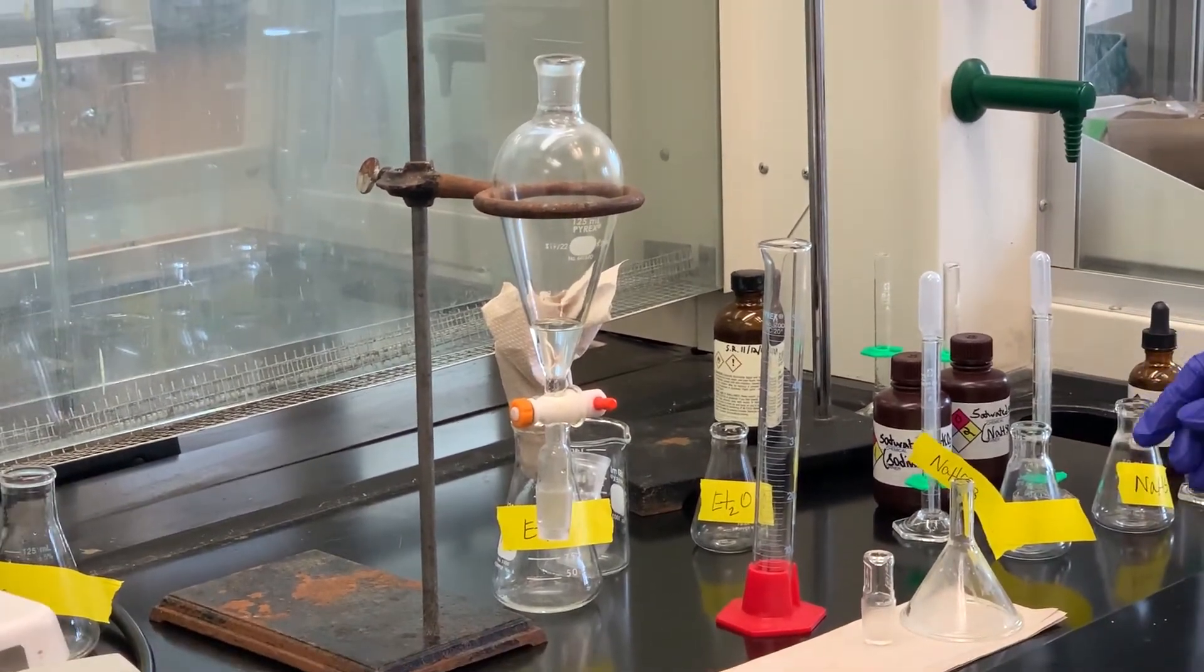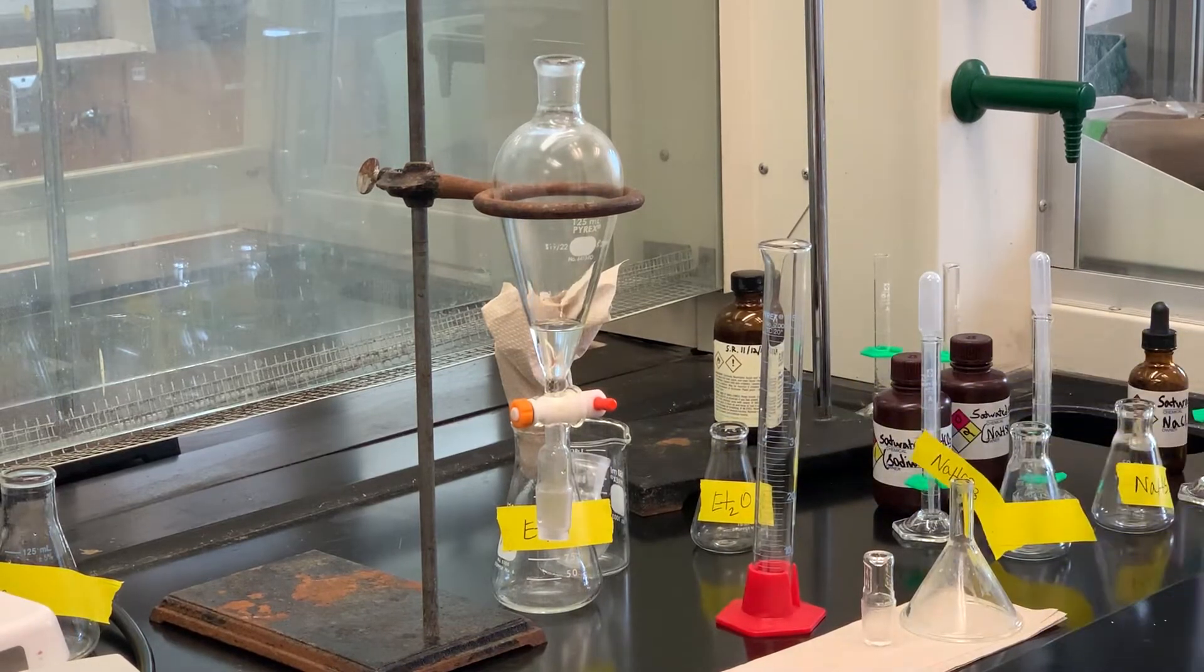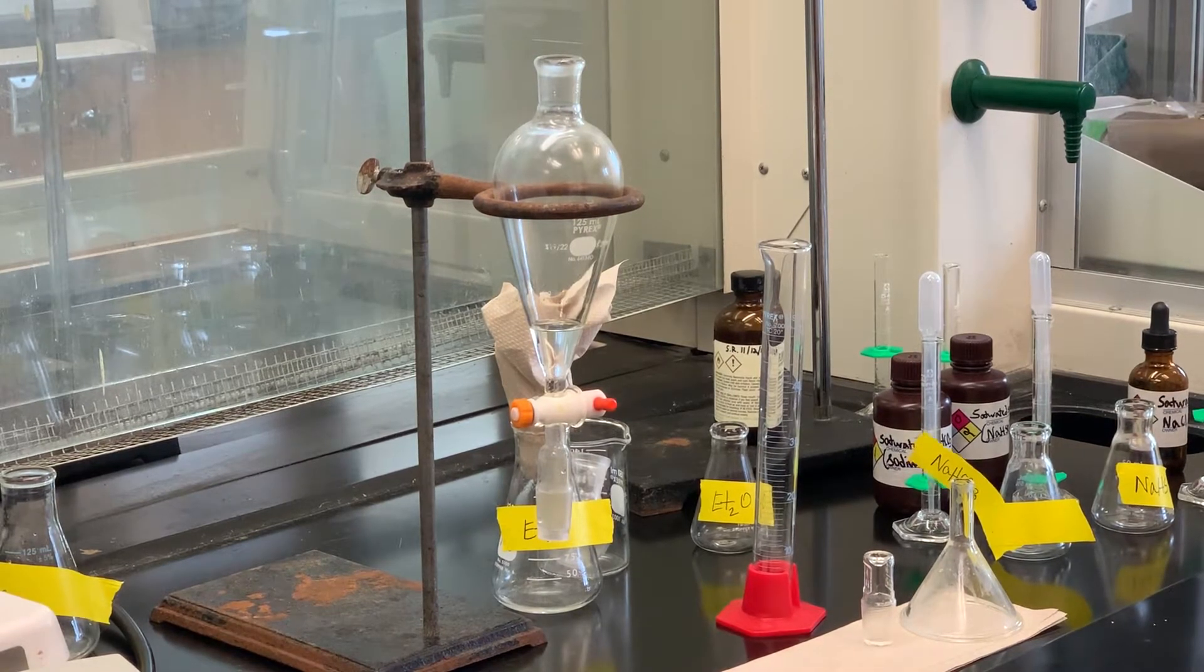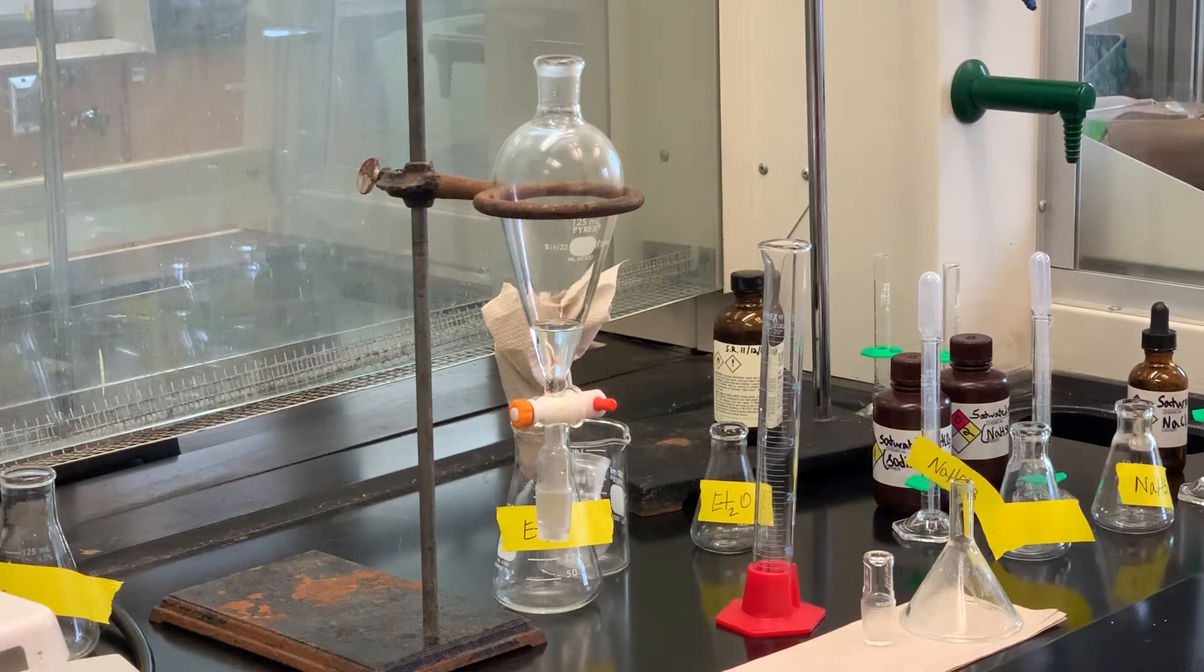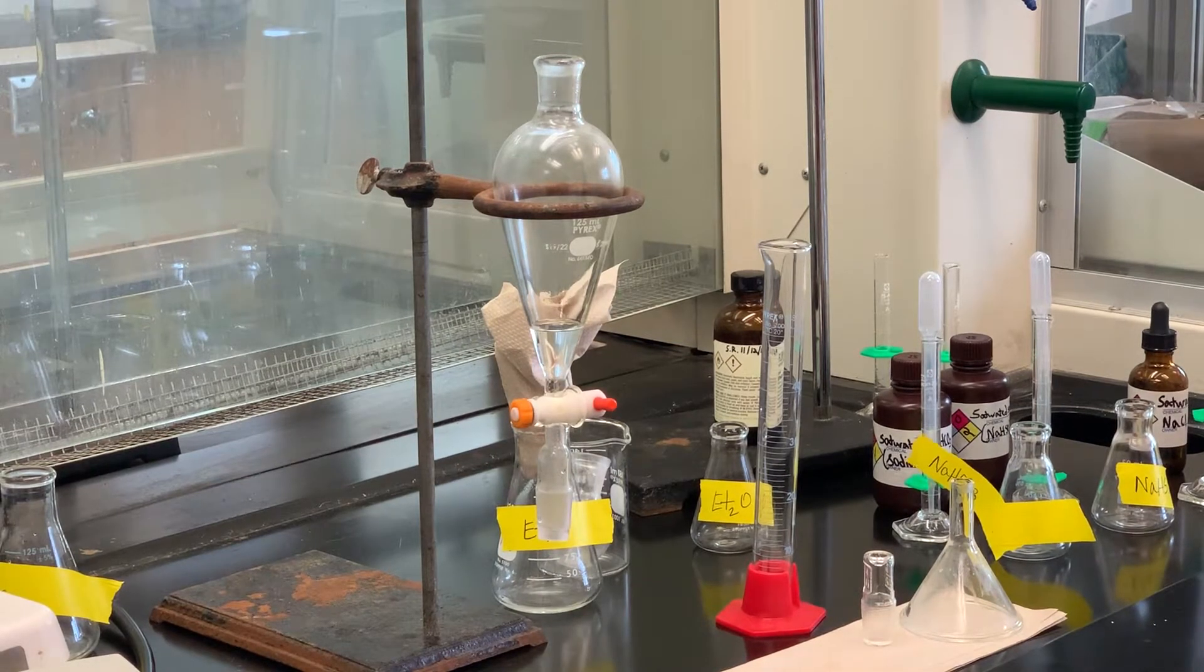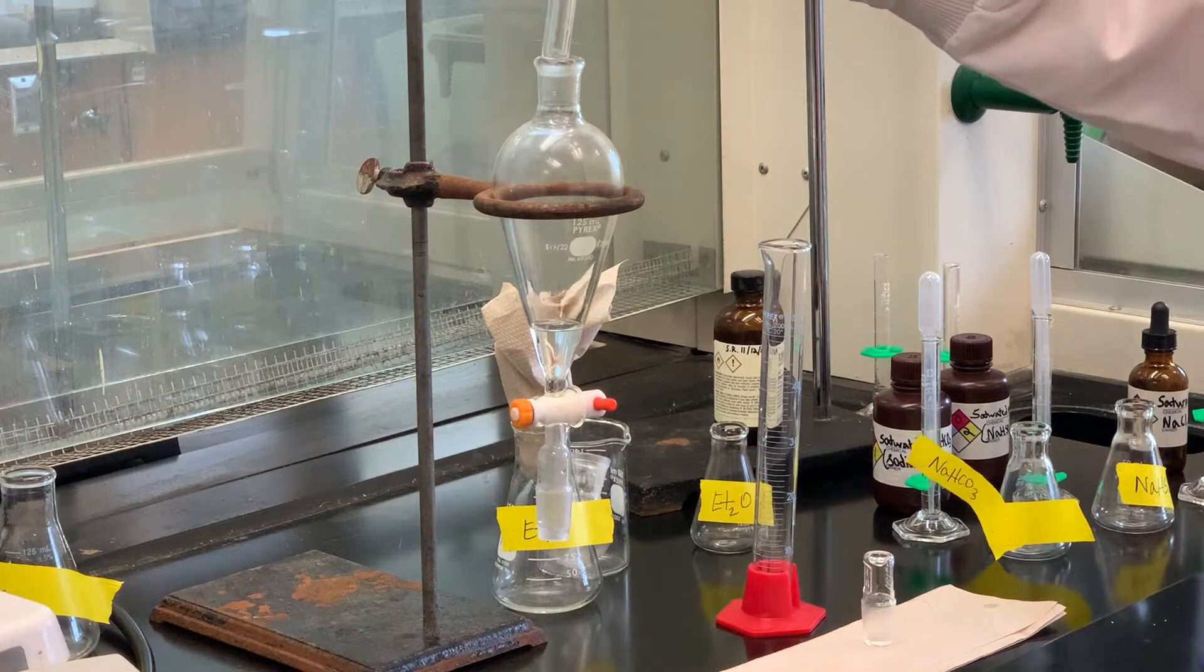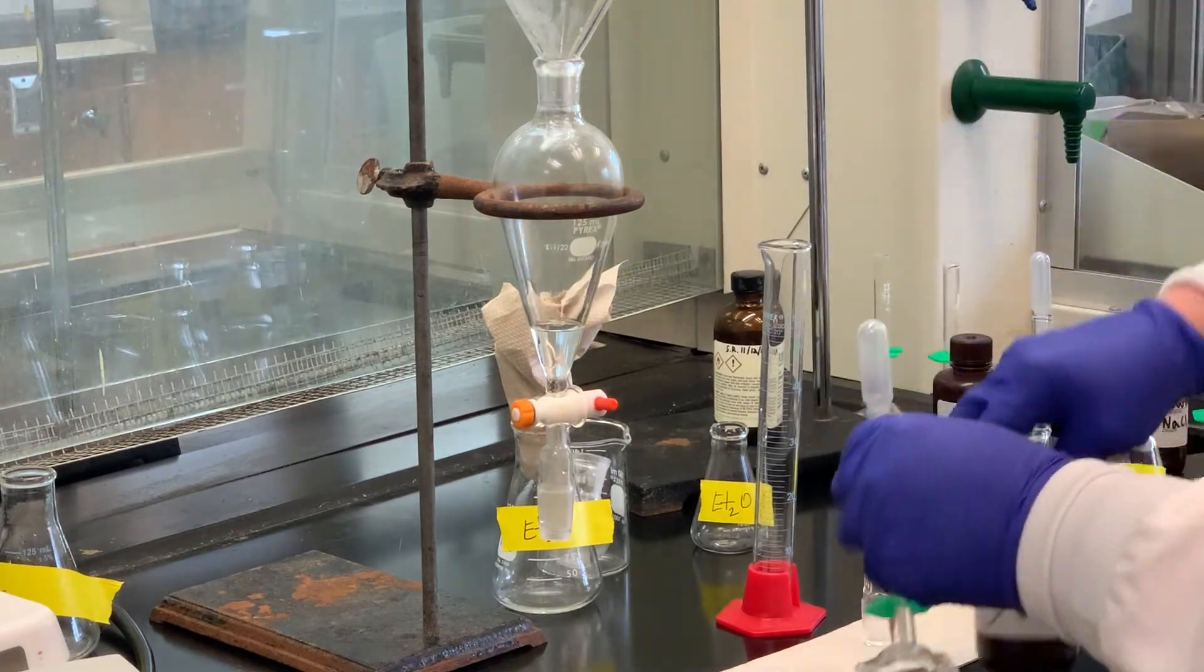So now what we're going to do is it goes through a series of washing. We're going to wash this organic layer with some sodium bicarbonate. That hopefully will neutralize any acid from the acetic acid that was left over. So we'll wash it with that. We'll separate the layers. All of the solutions are aqueous-based. The sodium bicarbonate, the sodium bisulfite, the saturated sodium chloride, they're all aqueous-based. So when we add them to this separatory funnel, the aqueous layer should go to the bottom in this case.